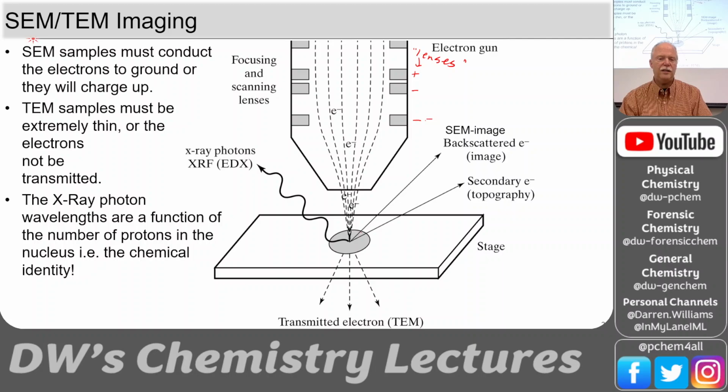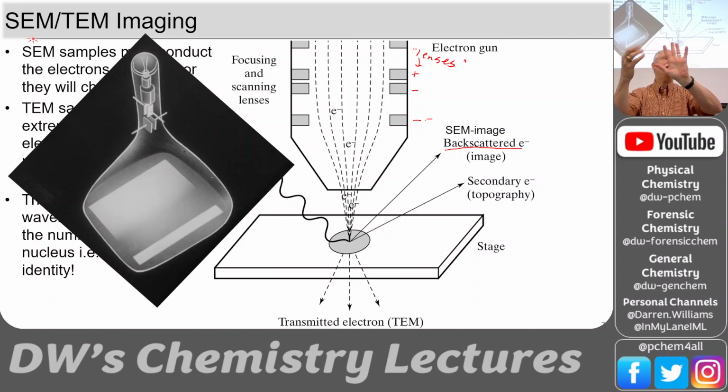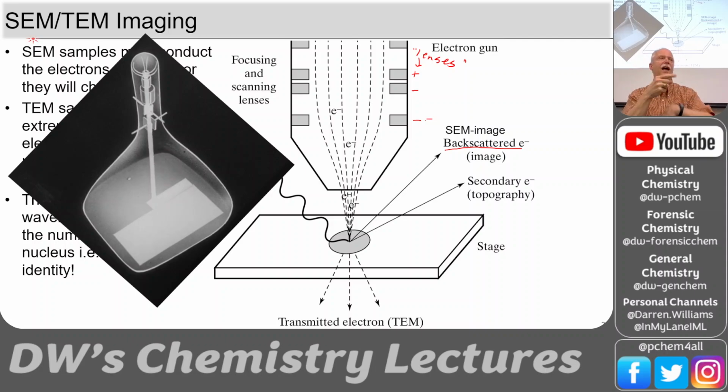And we can hit certain places on our sample and get backscattered electrons. So you need to raster the beam, and this is the term. Do you remember old TVs? This is what they did. This is like a cathode ray where they would shoot an electron beam at the TV screen, and you had phosphors on there. Whether they turned the beam on or off would give you bright light or no light. So the amount of electrons hitting your TV screen would give you the bright pixels or no pixels. And then left and right, you had a scan speed, and it would go down fast enough. You can kind of see this.